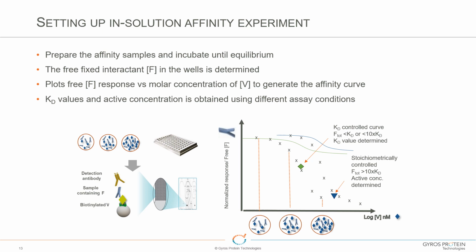Yeah, I think very much in the next podcast, where we go through the experimental setup, we'll go much more into detail on how to define a KD control curve and a stoichiometric control curve. Yeah. Because it's actually a very important part of the experimental setup. Right.